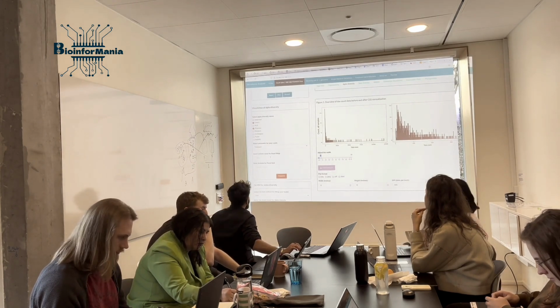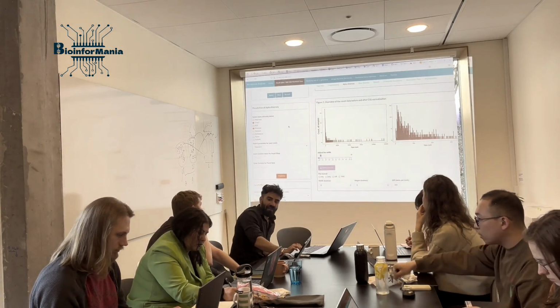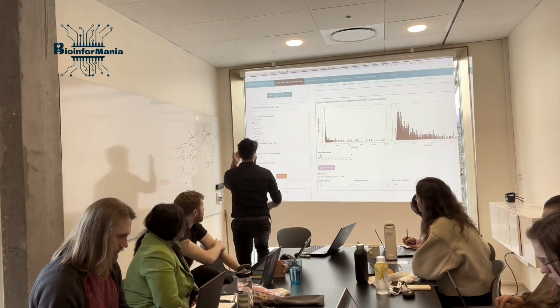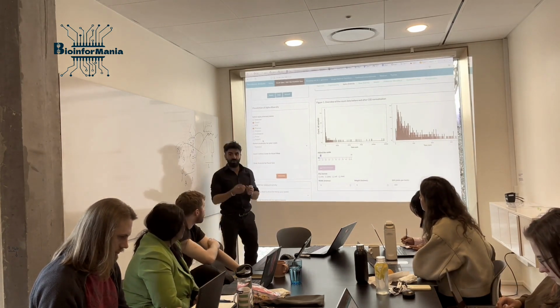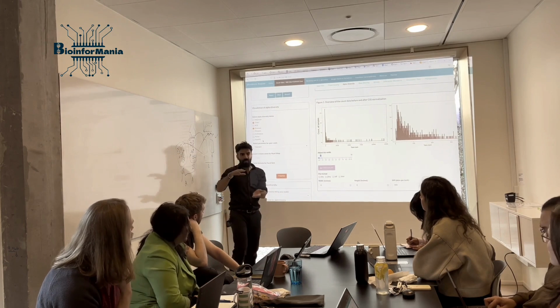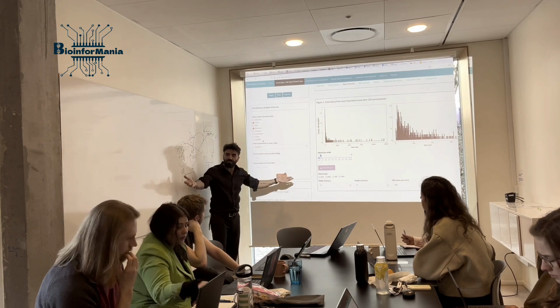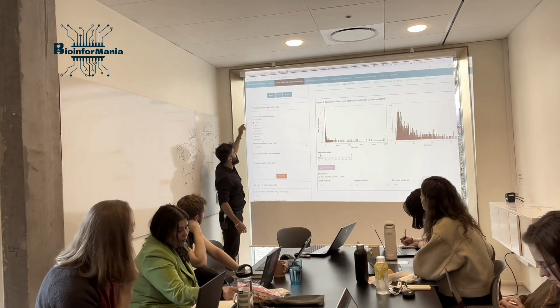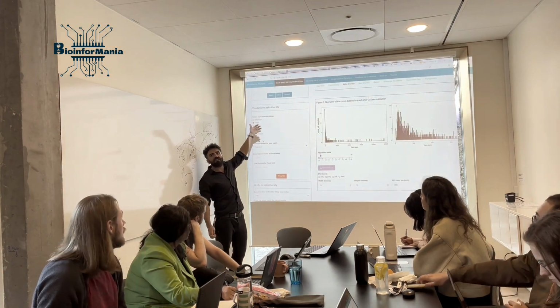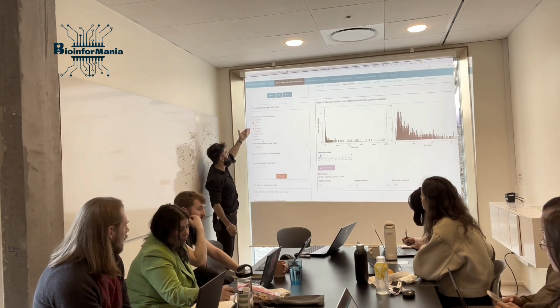Now that you have done some normalization or standardization on your data and the depth, you can visualize these alpha diversity indices. Alpha diversity is when you are looking into the mean or variance of your data within the groups, okay? Observed is just how many taxa there are. We call it richness. These two are for richness, Chao1 and this one. Chao1 takes into account singletons and doubletons as well. This one is basically the pure raw number of taxa that you have.